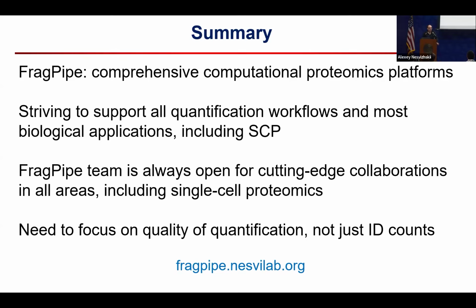It's a challenging one. I'll give you a simple example where it's actually turned out to be very challenging, like TMT data correction for the isotopic impurities, right? Sounds like a simple problem. You have so much of this channel leaking into this channel, and you solve the linear equations and you correct for the data. Well, it turns out that if you do that, despite what maybe Thermo would tell you or others, you actually make things worse, because for low abundant peptides, where you have the really challenging low abundant data, you start correcting for these things and you make things worse.